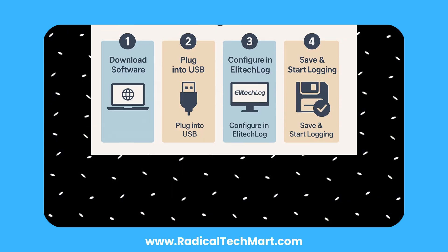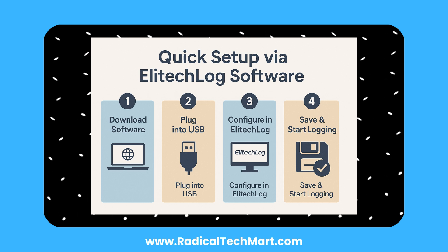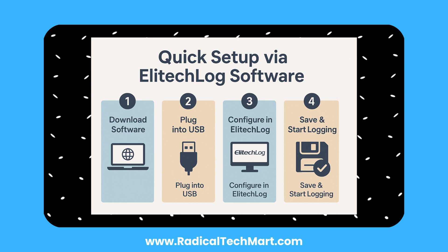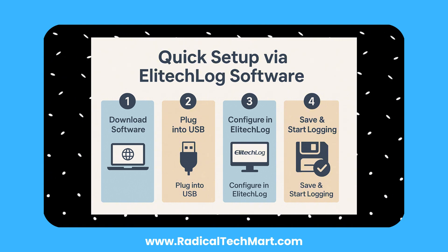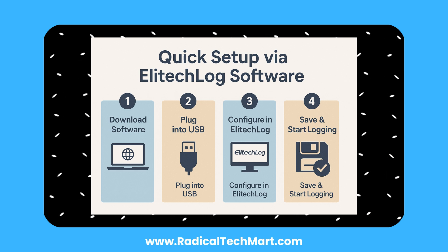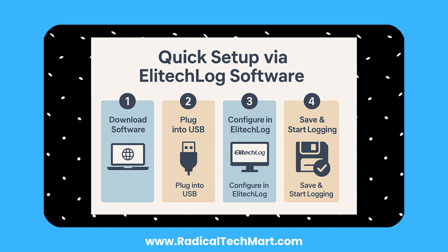Setting it up is easy. Download the Elitec log software from eliteclog.com and plug the logger directly into your computer's USB port. The software will automatically detect the device. In the parameters tab, you can set the logging interval, high and low alarm limits, start delay, audible alarm and button tones, and your preferred temperature unit — Celsius or Fahrenheit. Once done, click Save Parameter. The logger is now ready to use.